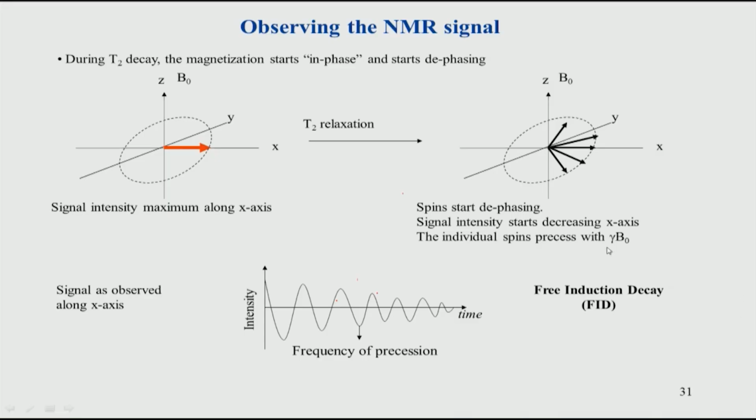Welcome back. So, in the last class we saw what is a free induction decay. This is basically the signal which is physically detected by the NMR hardware. Let us have a look at it once more to make it more clear. So, what is a free induction decay? A free induction decay essentially is EMF which is induced in the coil when the nuclear spins start moving around.